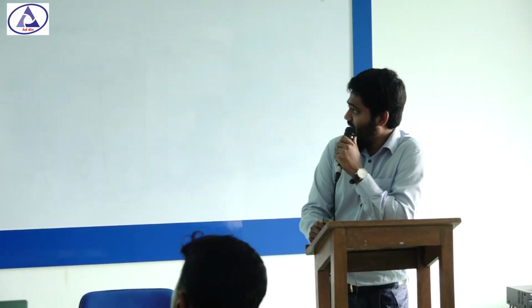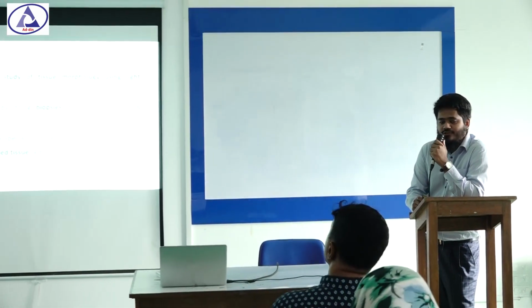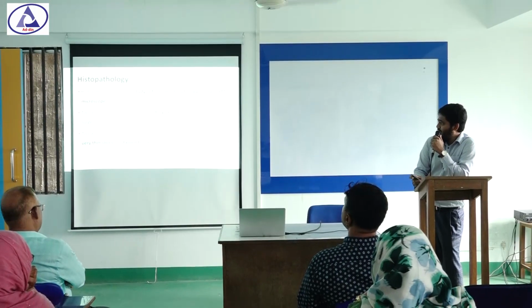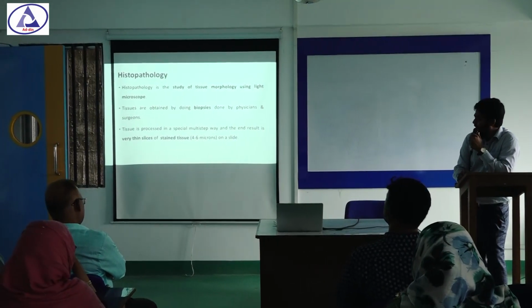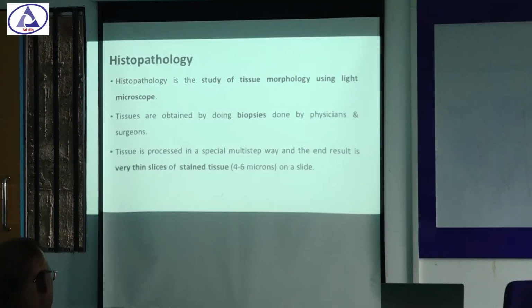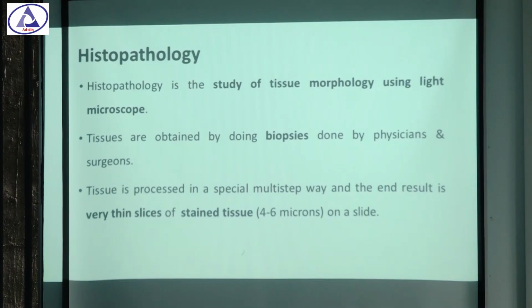So first, histopathology. What is histopathology? It means the study of morphology from any biopsied specimen. So the next question is, what is biopsy? Biopsy is any tissue that has been taken from a living person for diagnosis of any disease. Then the tissue is processed in a multi-step way, and we finally get very thin slices of stained tissue on a slide.